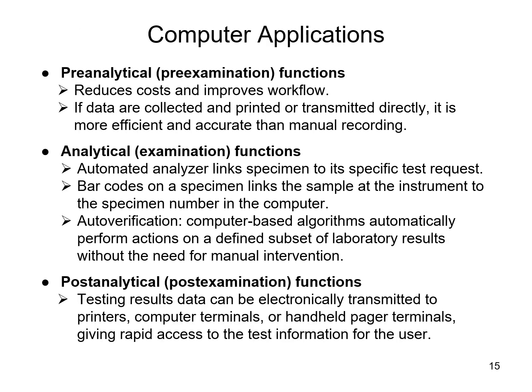The computer applications have helped to improve things like pre-analytical functions. This is the phase before you examine the sample. And so by using computer systems, you're able to enter the order into the computer system. Everything's tracked. You're able to sometimes print requisitions, print any sort of collection labels, things like that. So it takes away from handwriting. It helps with patient identification, and it just improves the whole workflow.